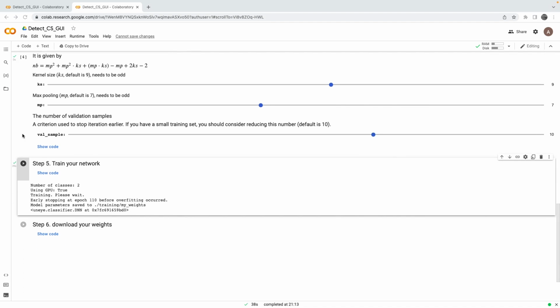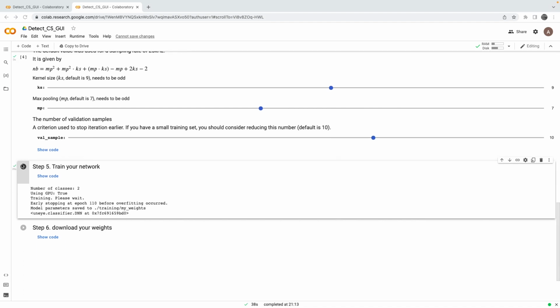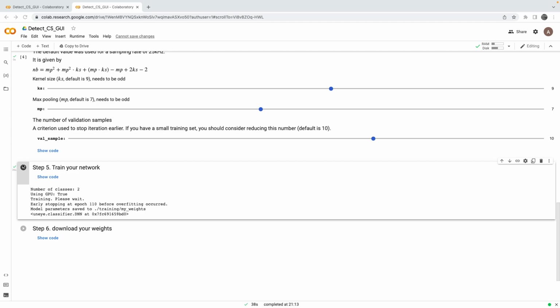You can proceed with the next step, which is training your network. I also did that already. It took me some time, maybe less than a minute or something, or perhaps a bit more.